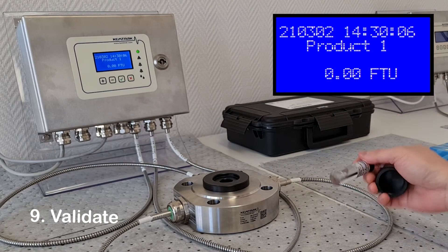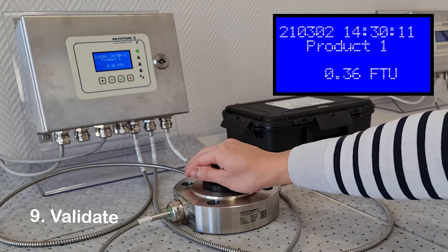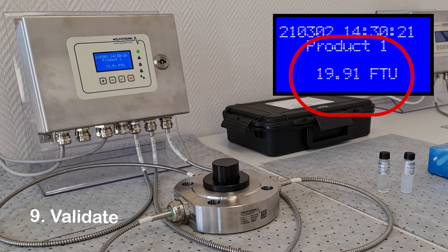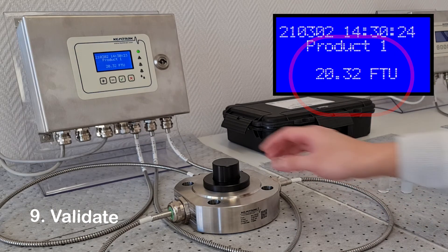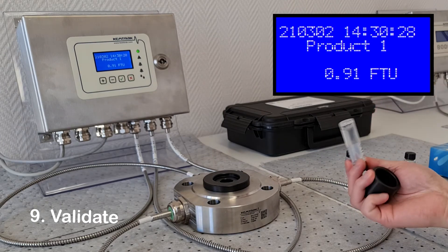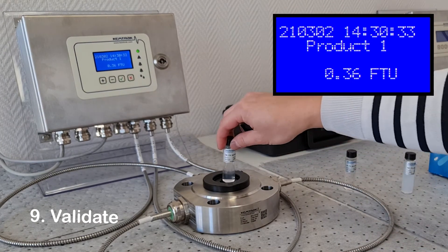It is essential to always validate a calibration once complete. Do this by simply placing the vials back in the holder and confirm the measured values are correct. Our recommendation is to validate an instrument first, as in many cases the instrument will not need recalibrating.